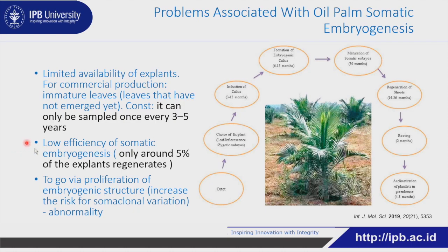They harvest the immature leaf from their plantation in Riau, for instance, and they ship it to Bogor, and they start to initiate the embryogenesis.